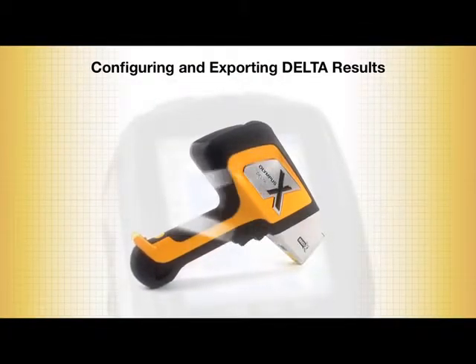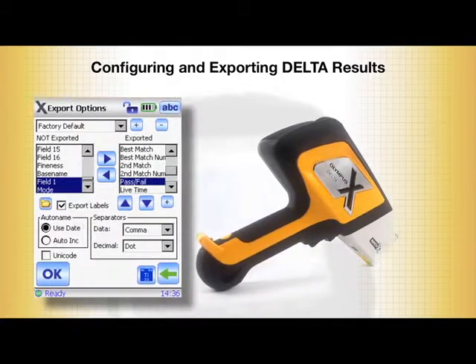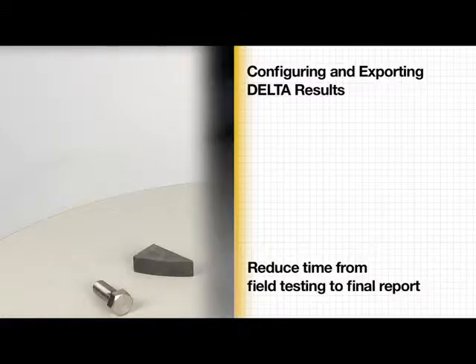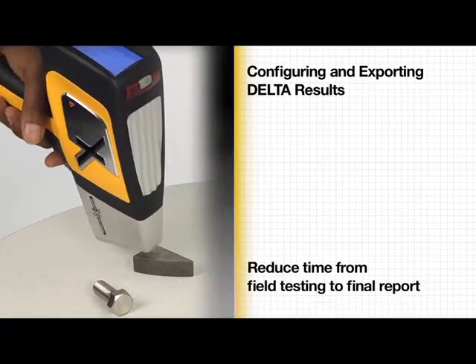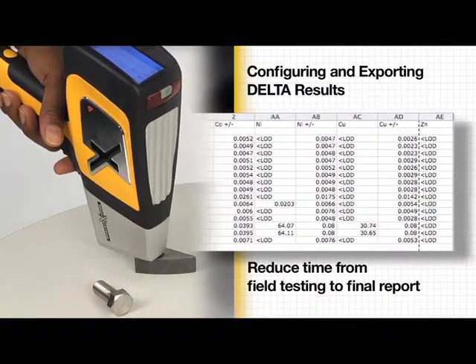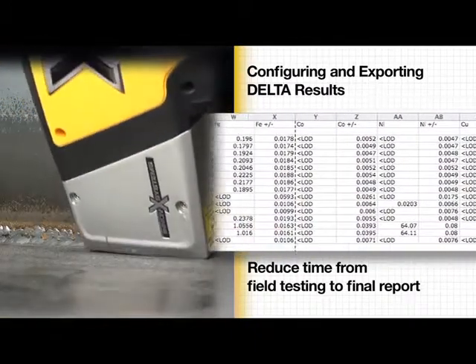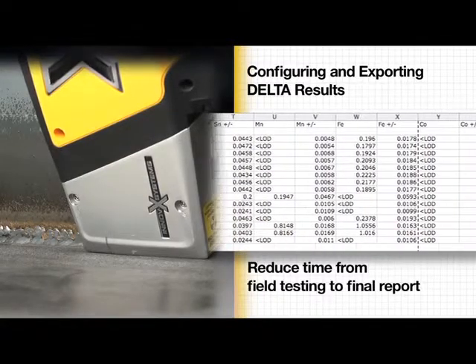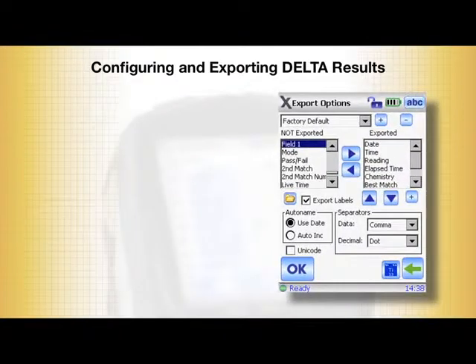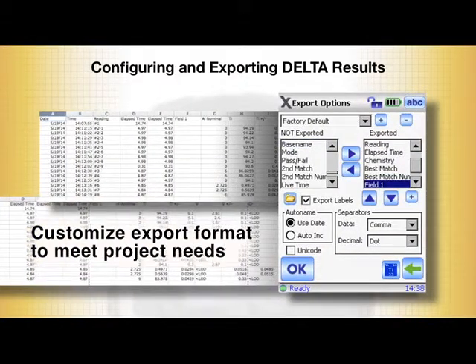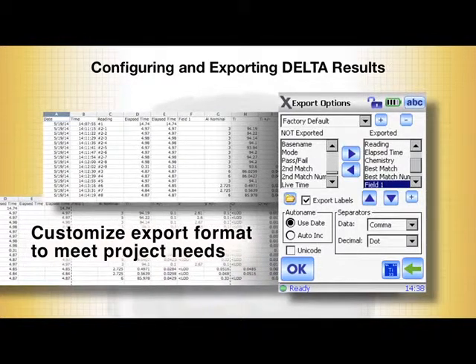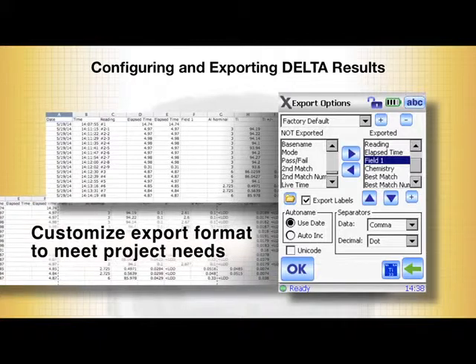This video will show you how easy it is to export test results from the Olympus Delta handheld XRF analyzer and how to reduce the time required to go from field testing to the final report. The results report generated by the Delta, whether in digital or hardcopy form, is often the most important outcome of field testing. The ability to customize the Delta's export format to meet the needs of your project, application, or company's preferred data format is a powerful time-saving feature.